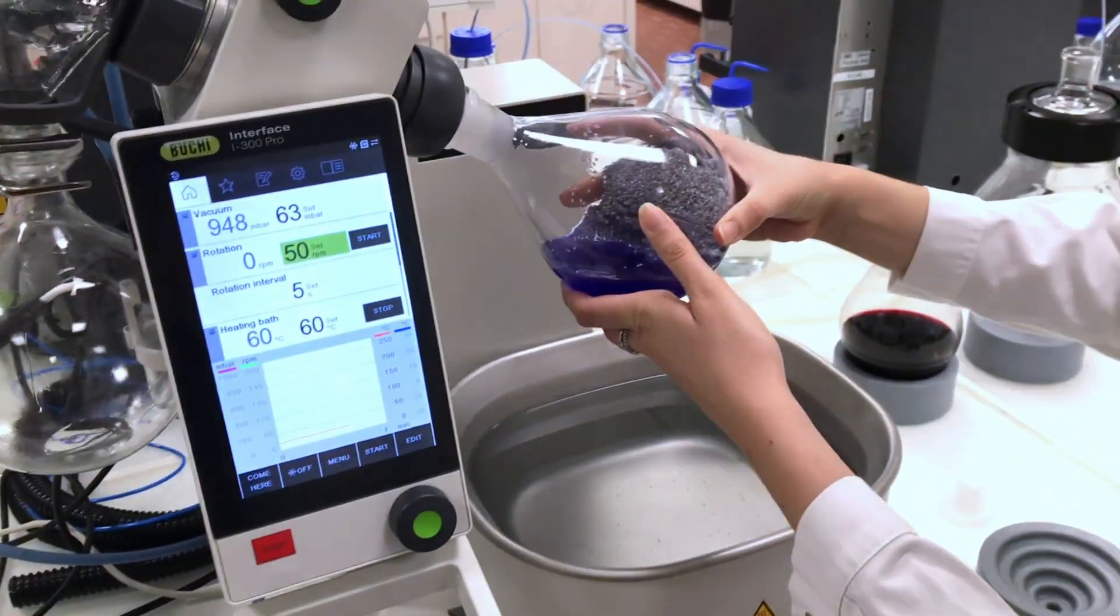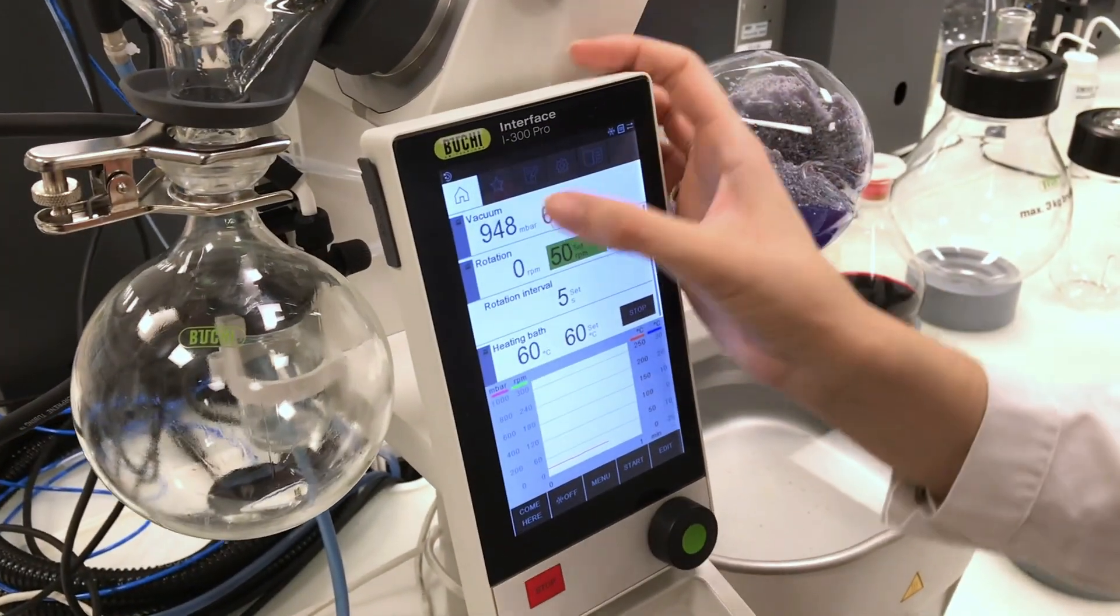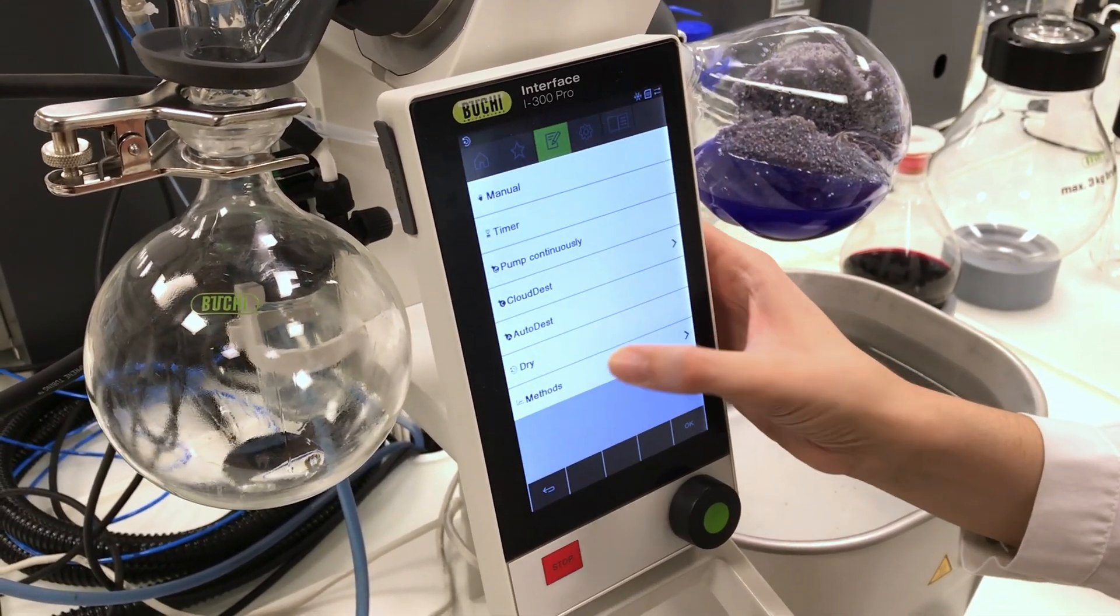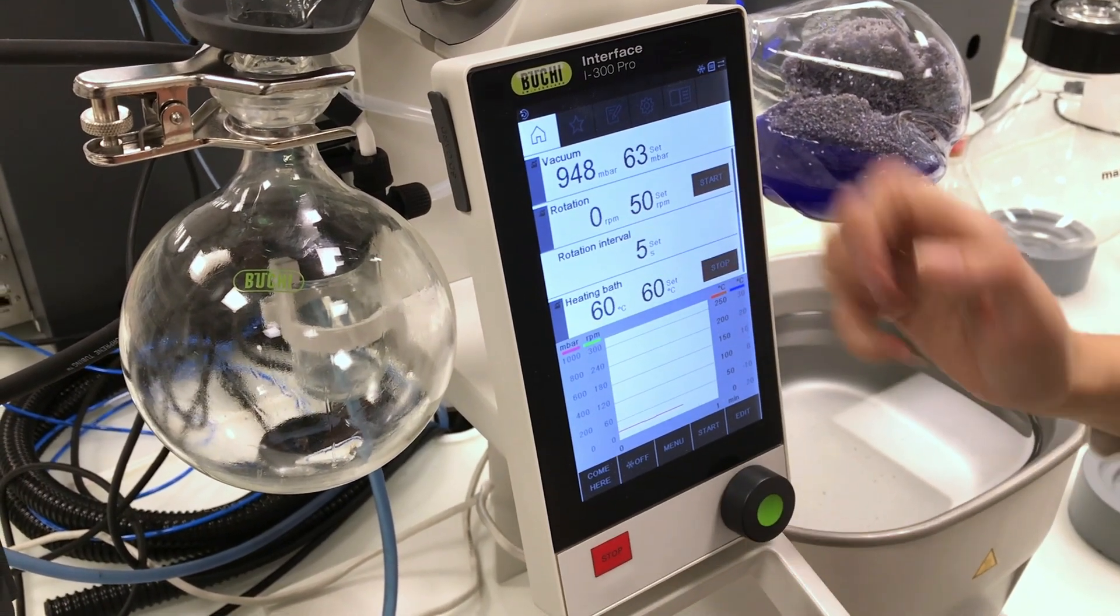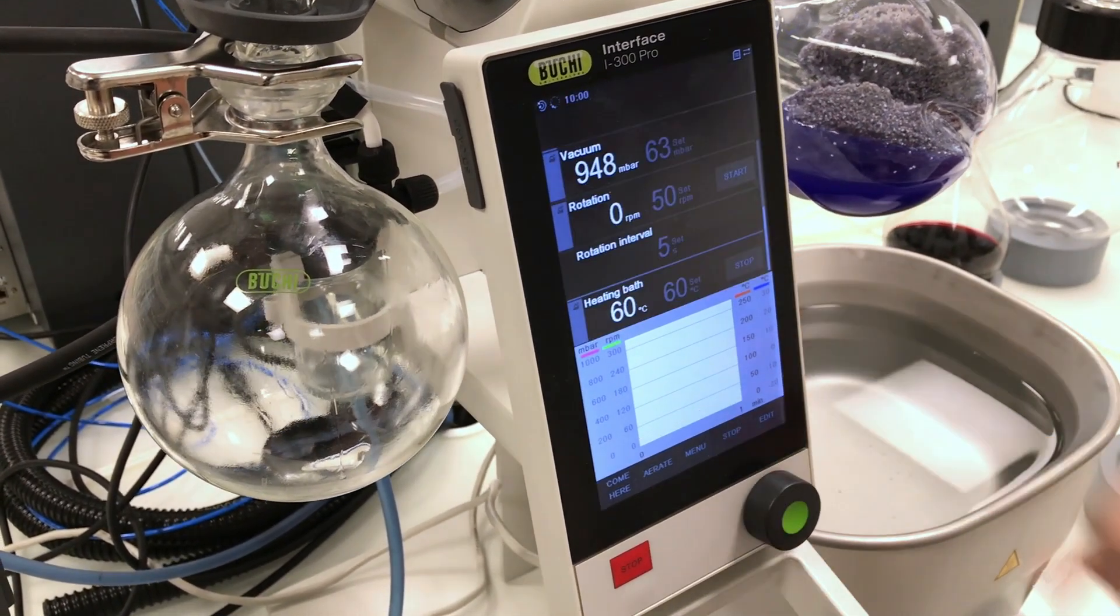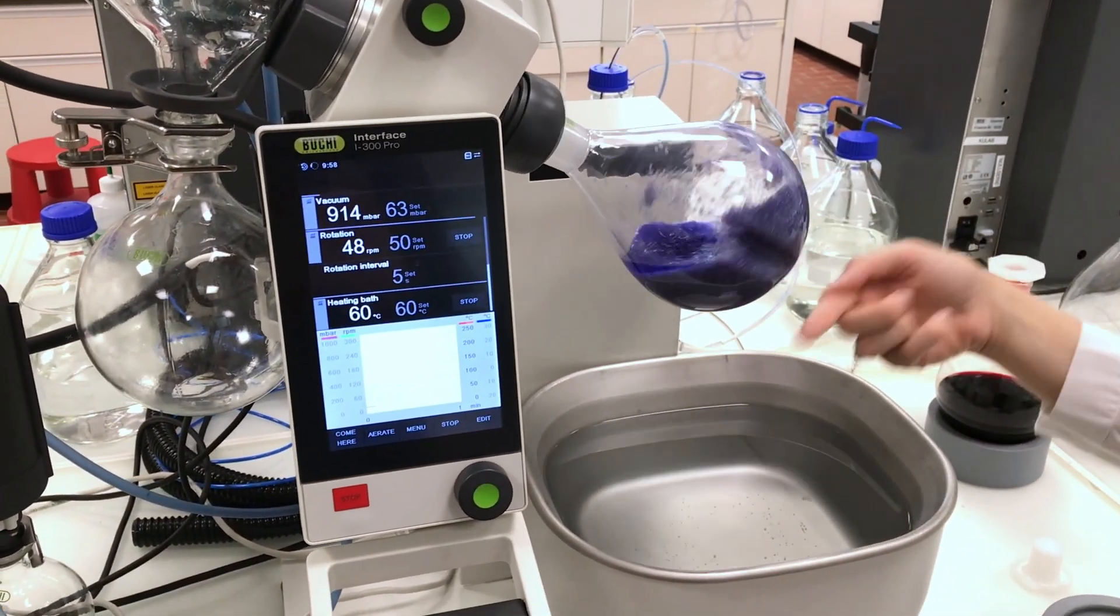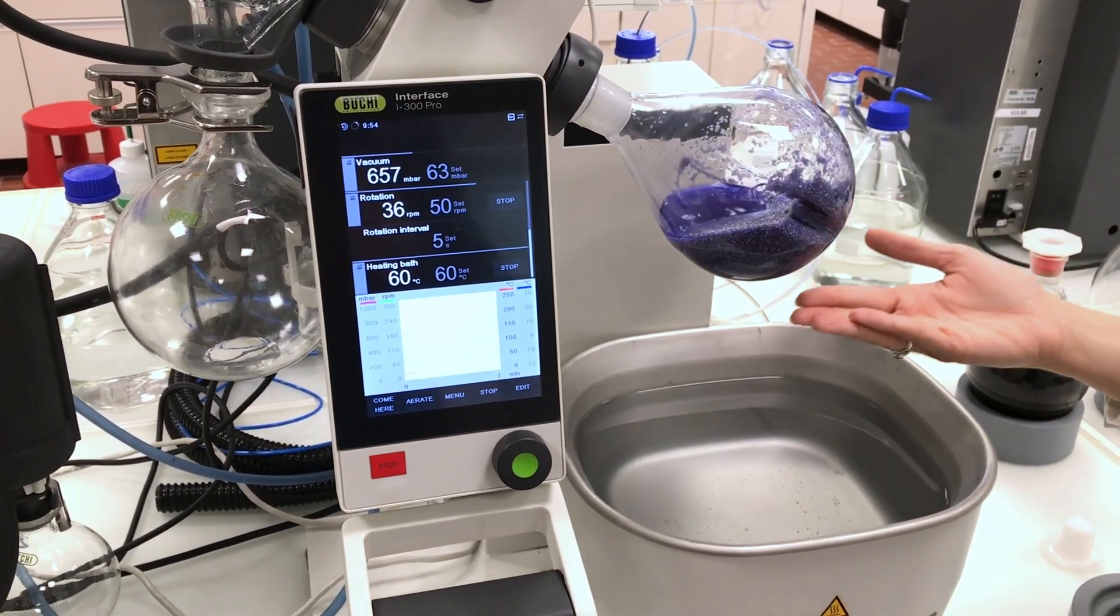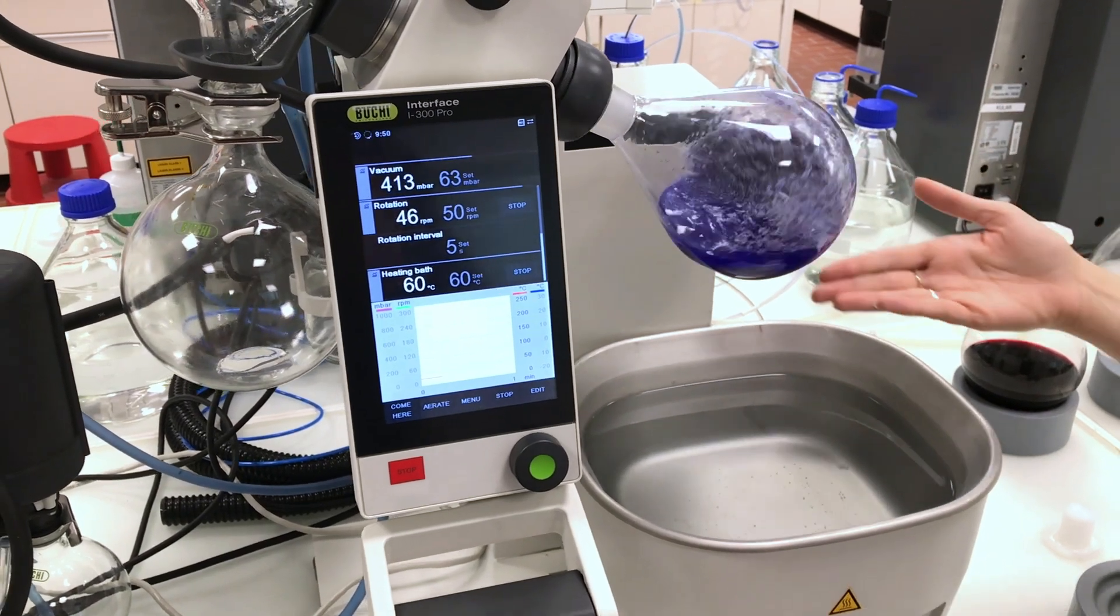So now we're going to check what we call the dry mode. It's just here in the library and I choose a rotation interval of five seconds. What does that mean? It means that the flask is going to rotate on one side for five seconds and then start rotating on the other side. So again, if you have powdery compounds that stick to the flask, this prevents this issue.